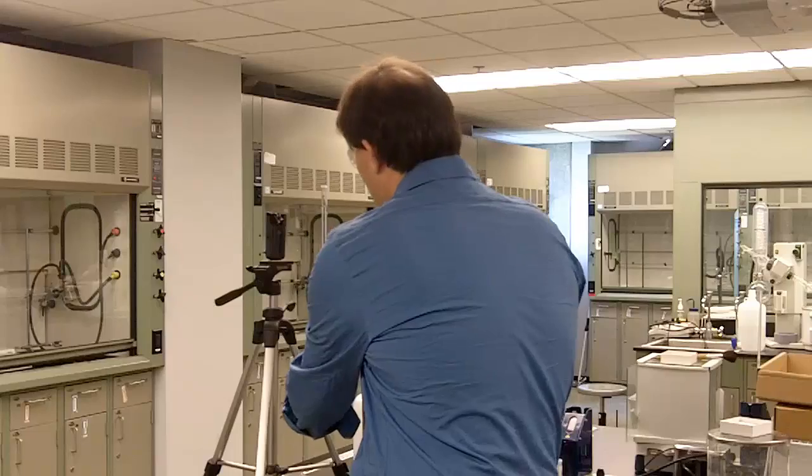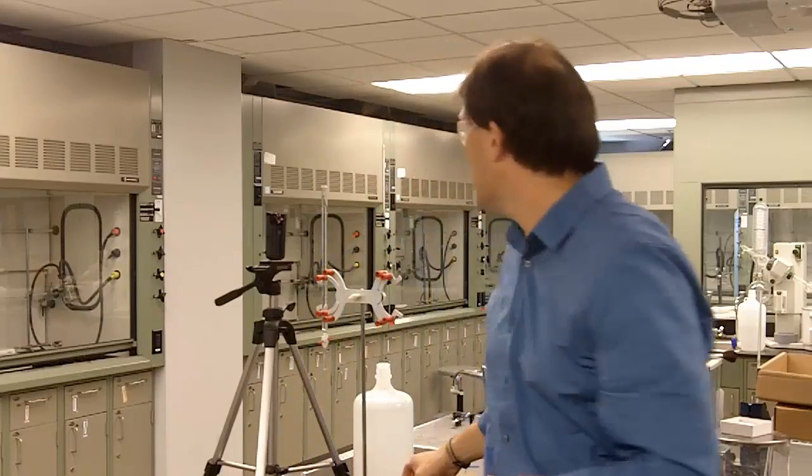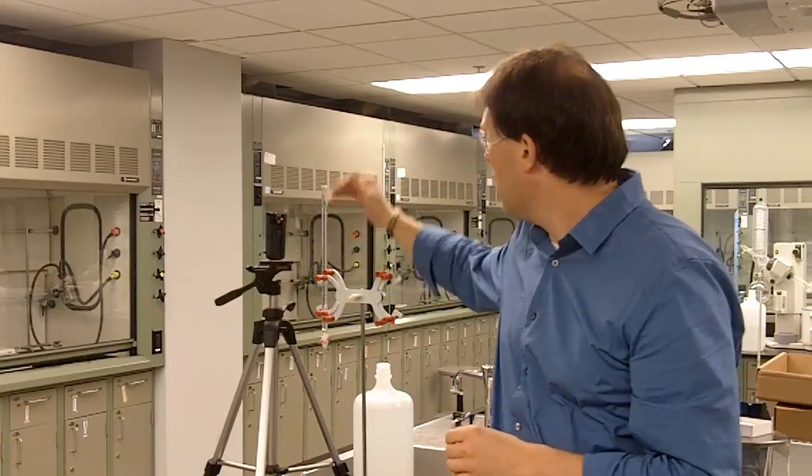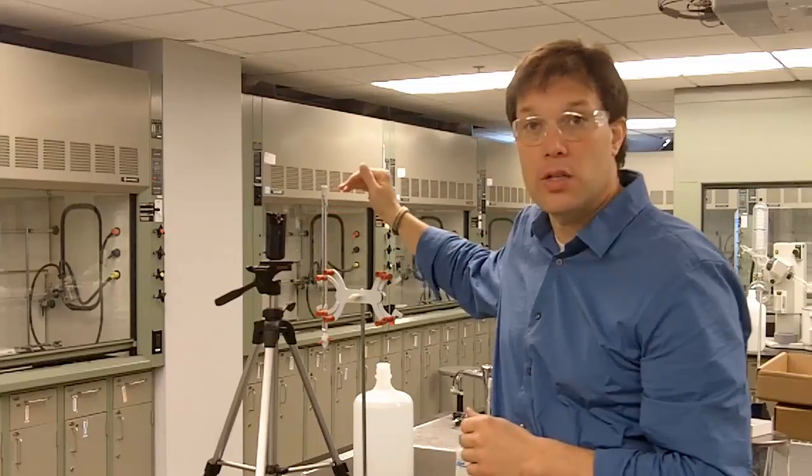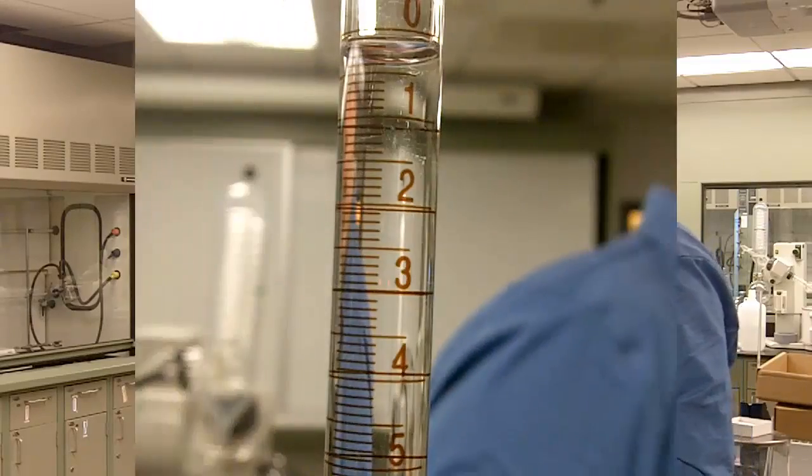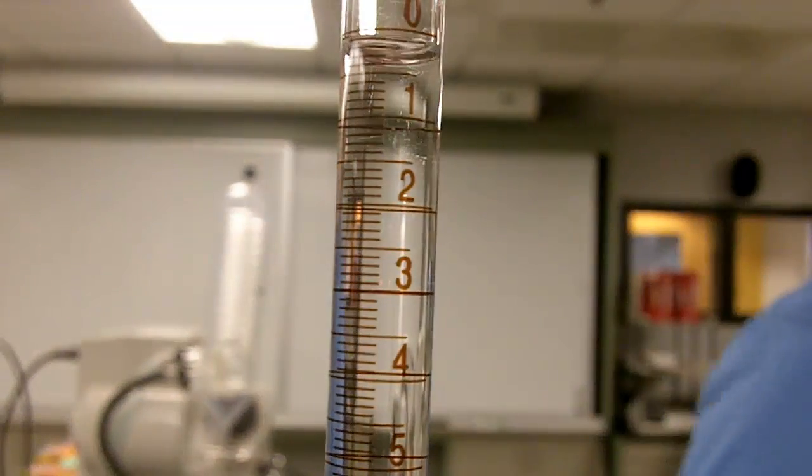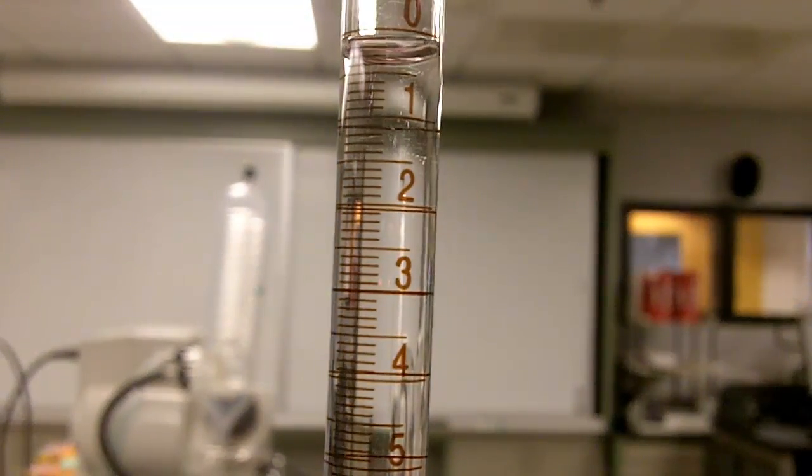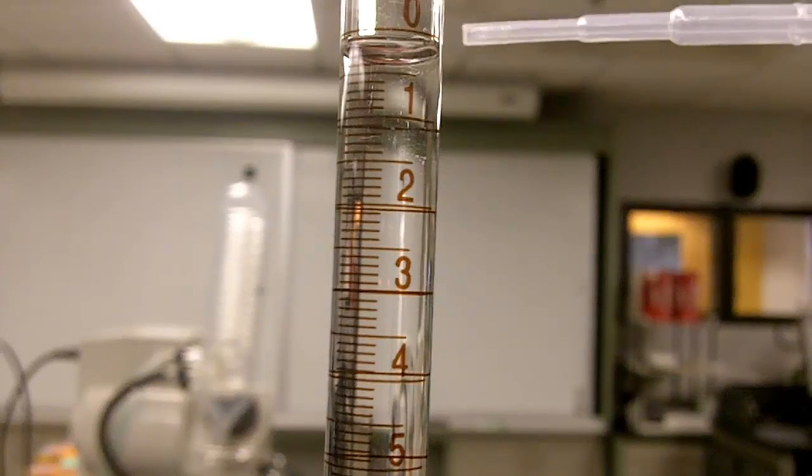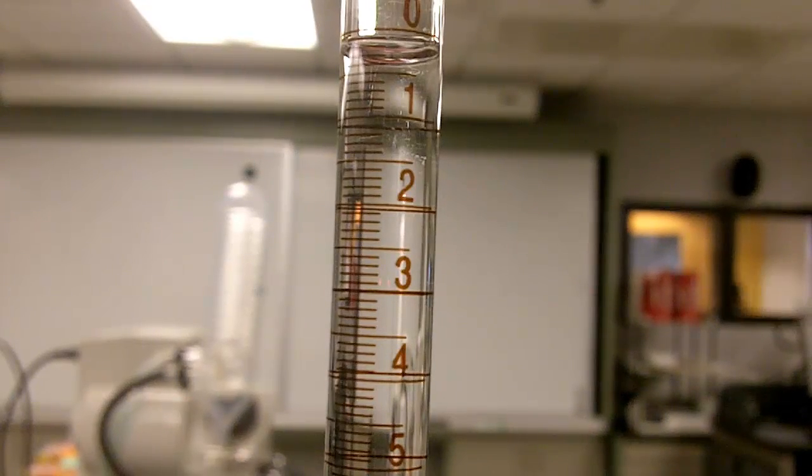So there we go, we drained it back down so that the meniscus of the water here is falling in the graduation range of the burette. So looking at this then what we can see is the meniscus here and the bottom of the meniscus actually falls at about 0.21.